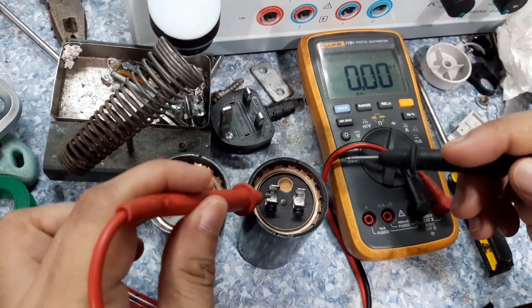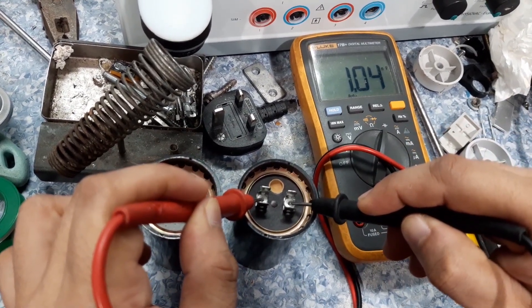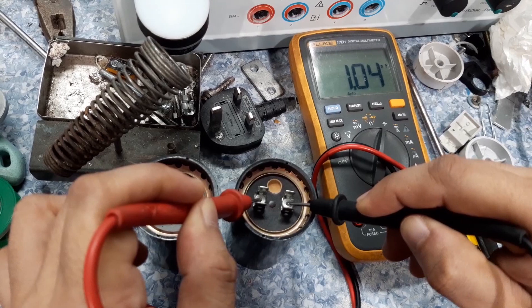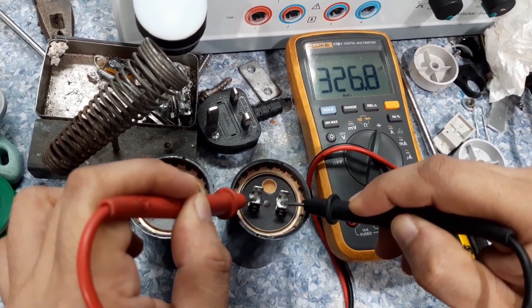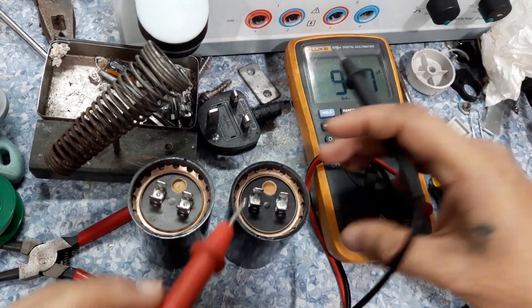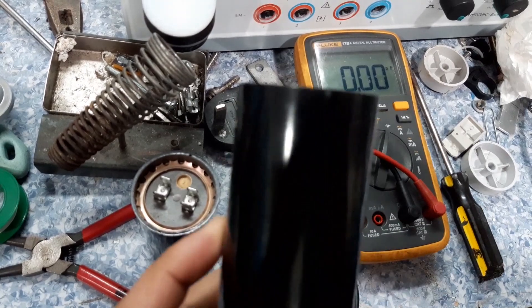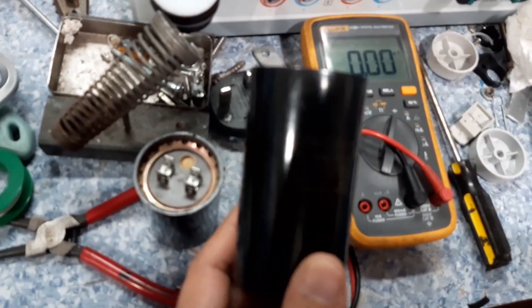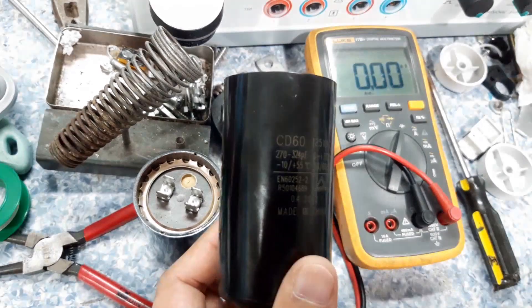And this is the new one. Let us see. Okay, and we have got 326 microfarad. The rated value of this capacitor is 270 up to 324 microfarad.